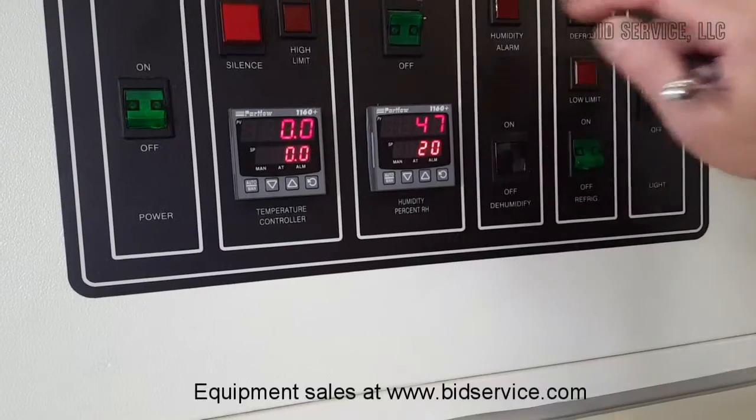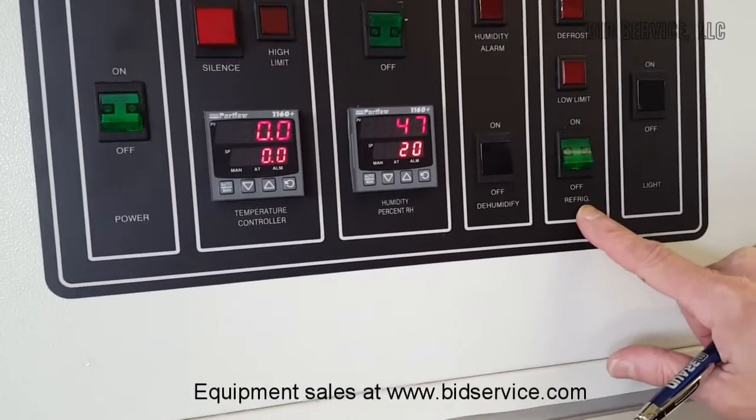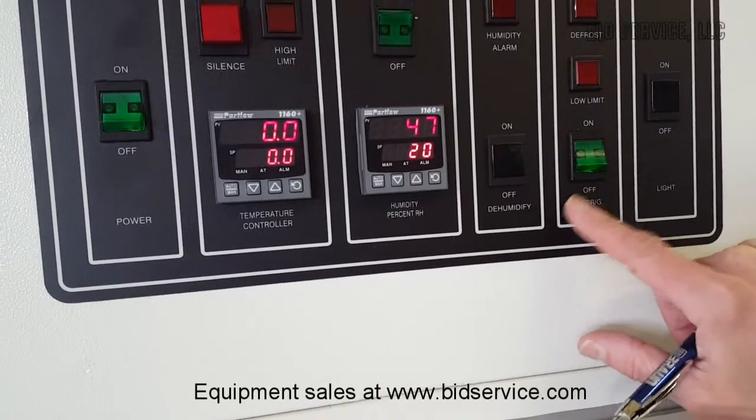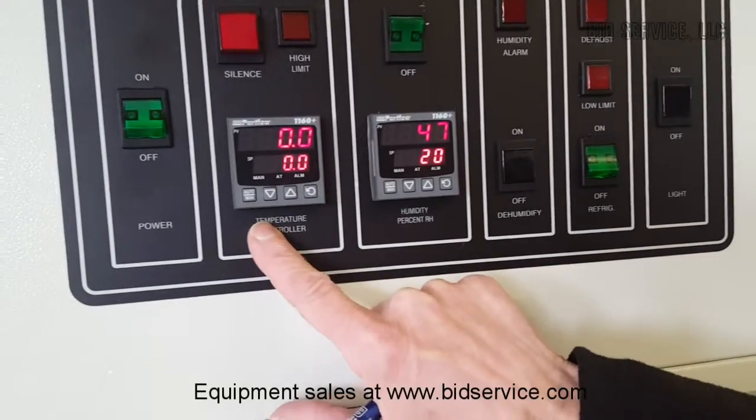Humidity can be turned on or off — it's off right now. You have a refrigerator on/off switch here. Normally at anything above 37 degrees Celsius, they recommend that the refrigerator is turned off. And this is your heater controller here.